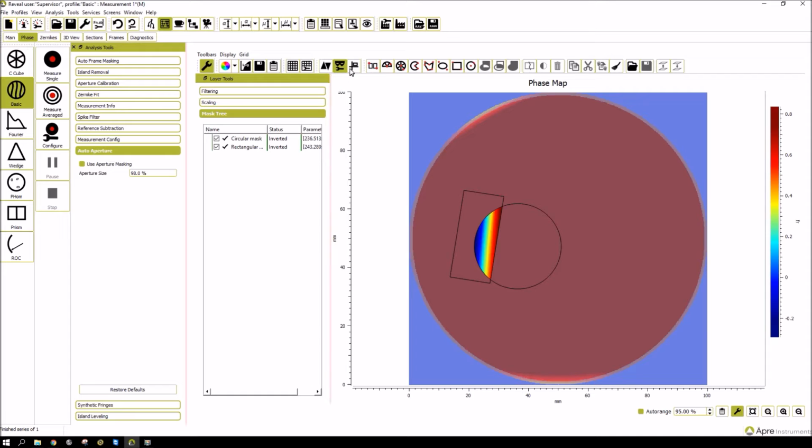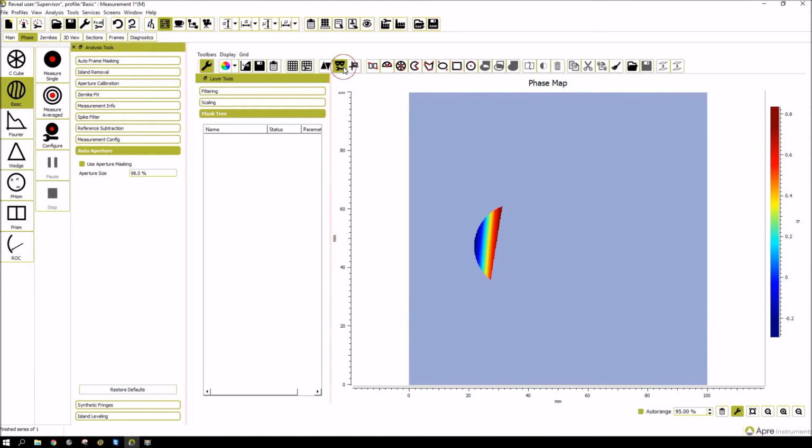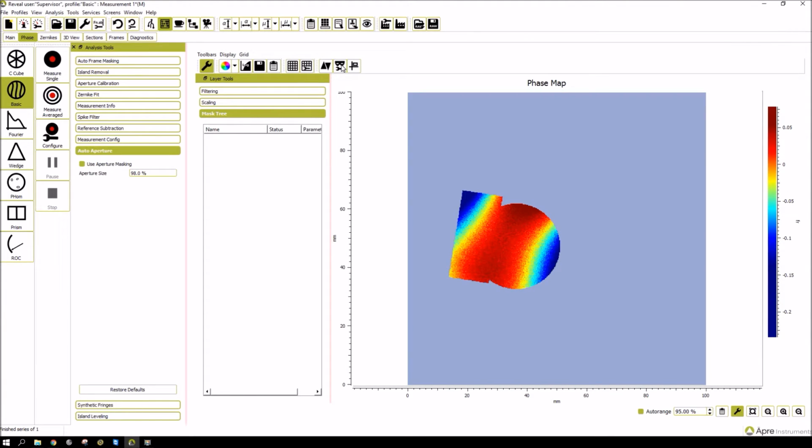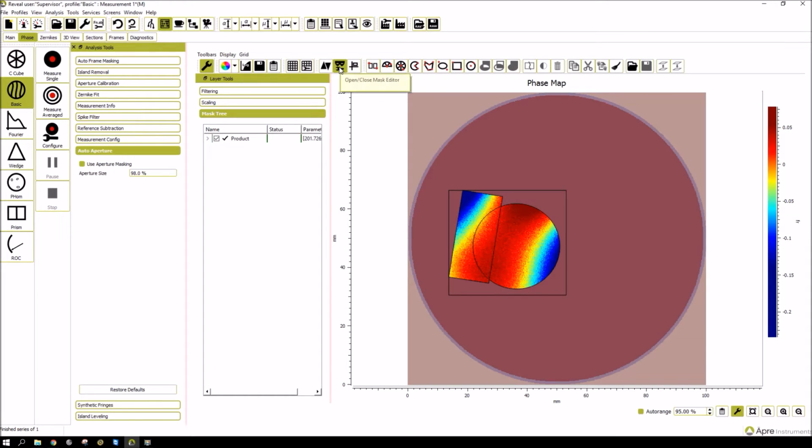And just looking at this quickly, you'll see that it's the same because they're already excluding everything outside of them, and the only inclusion is the overlap. But this time we're going to look at the intersection of these two, the product. So we're going to do a product of these two masks, and now we get the entire mask. So De Morgan's rules are what control how masks are combined.